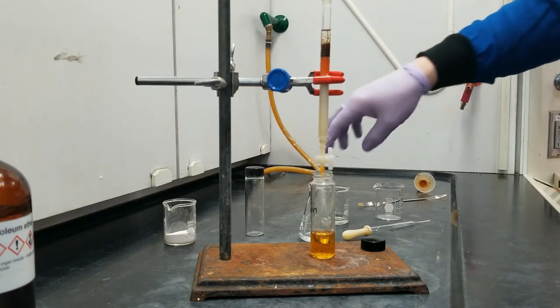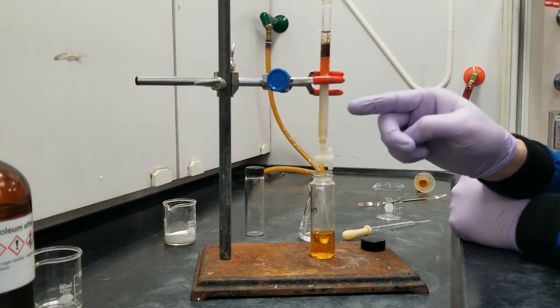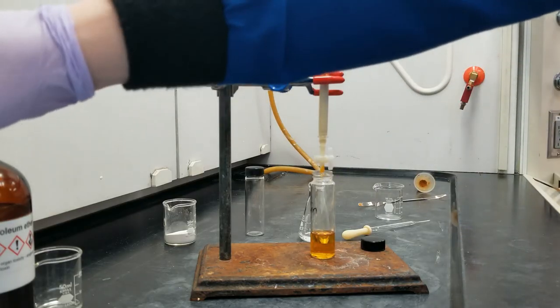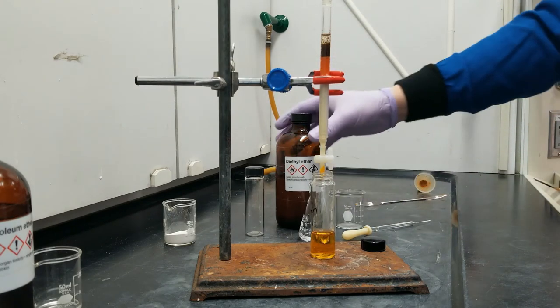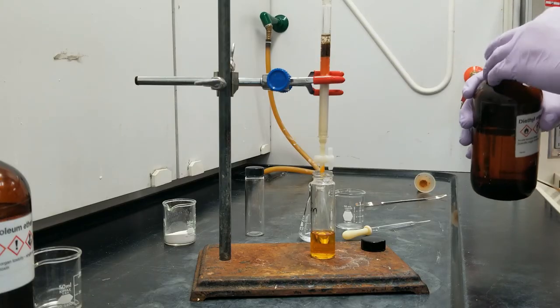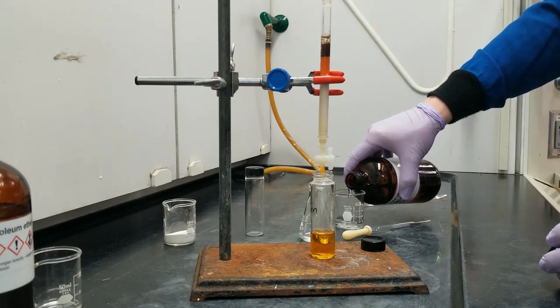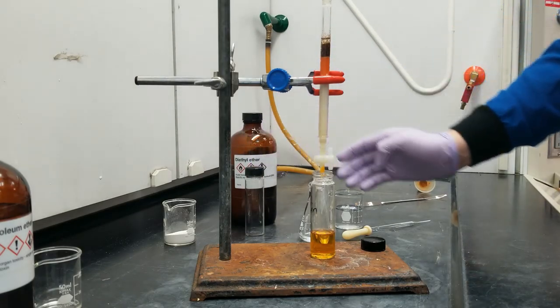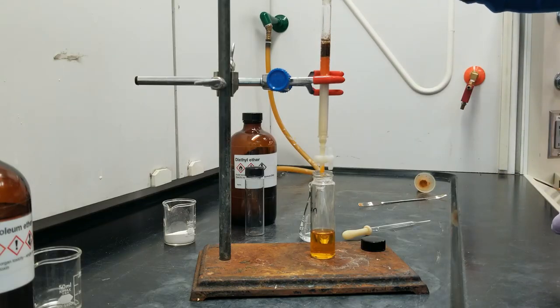I'm gonna be done with petroleum ether now. I think that the color of my alumina has returned almost completely to white. I'm gonna start adding diethyl ether instead, because not only is this going to start pushing down the acetyl ferrocene, it's also going to remove the very last of the ferrocene from the system as well. And I'm going to have a little bit of petroleum ether, diethyl ether mixing, and that's okay. This is almost entirely diethyl ether at this point.